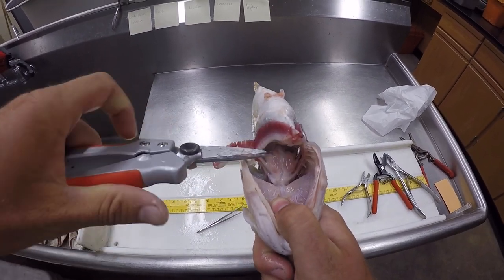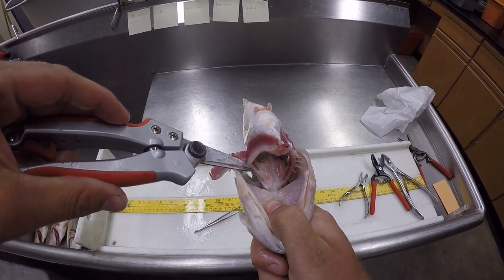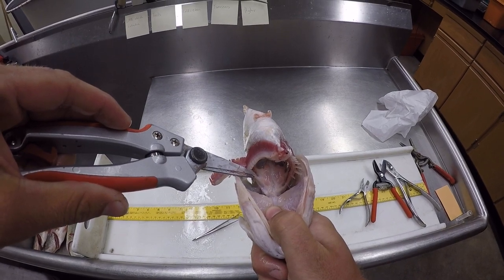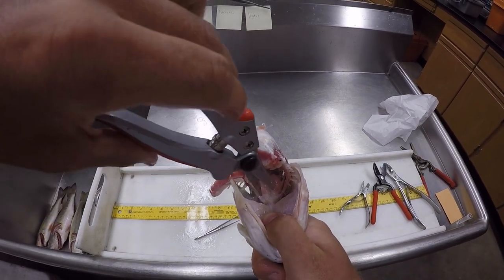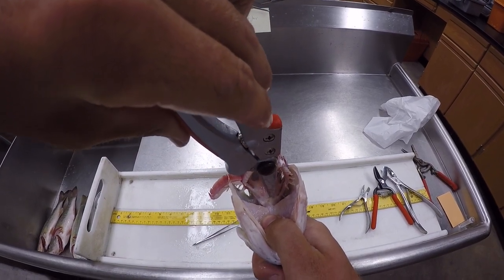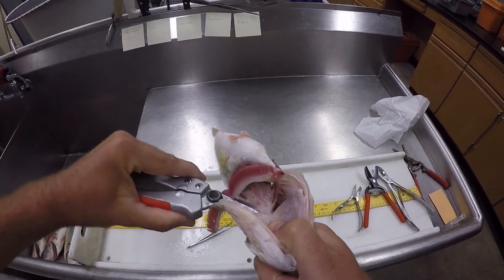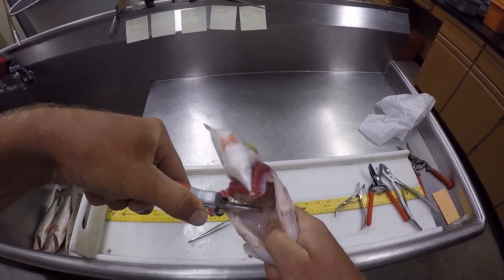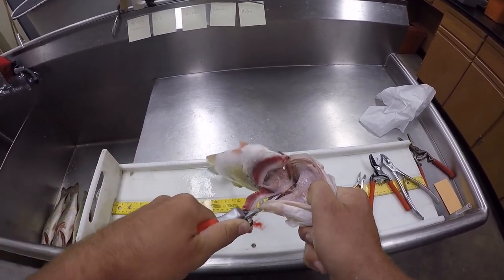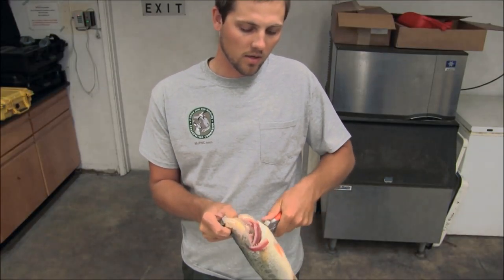Now these otoliths are going to be sitting in a capsule called the otic capsule, on the base of the spine, so kind of in the top of the mouth. Some people will go ahead and make a cut and crack it right wide open, but for today's purposes I'm going to clear all the tissue out so you can really get a nice look at what capsule I'm talking about and where on the capsule you really want to be cutting.